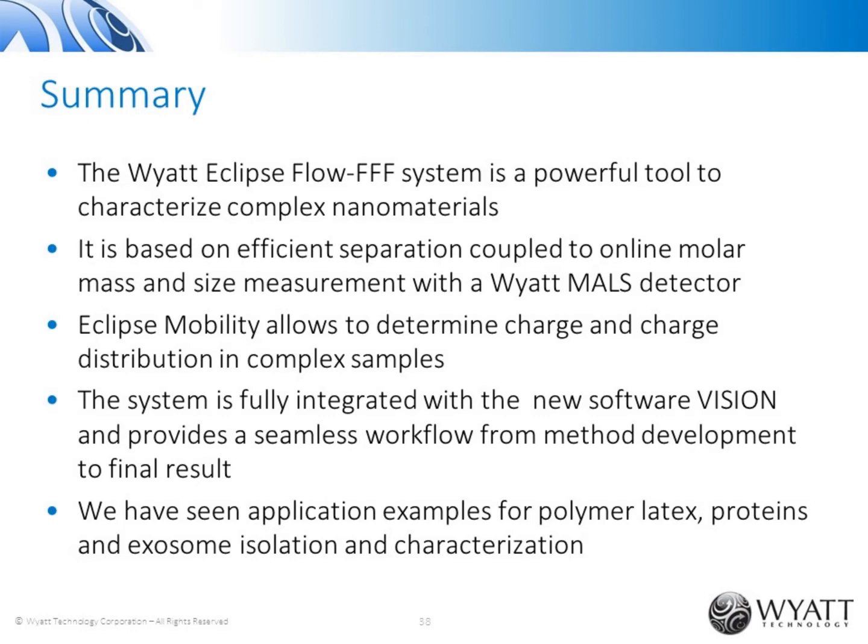Great. Here's the next question: what is the lower detection limit for the number of particles that can be counted? Yes, that depends a lot on the signal to noise of the light scattering measurement, because the number we calculate needs a highly precise light scattering signal. Also, of course, the smaller you get, the larger the numbers become, and that is also a limitation on the accuracy and precision of the measurement. So I would say that maybe you can go down to something like 30 nanometers or 20 nanometers, but not much lower. Then of course it becomes more difficult.